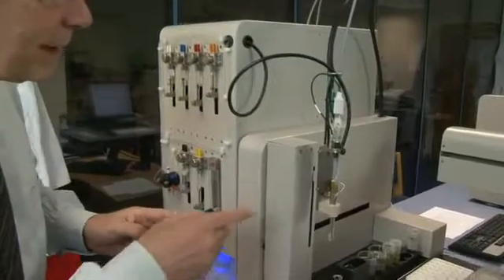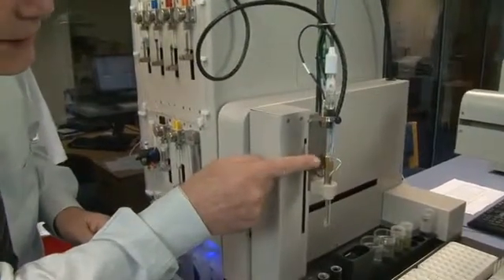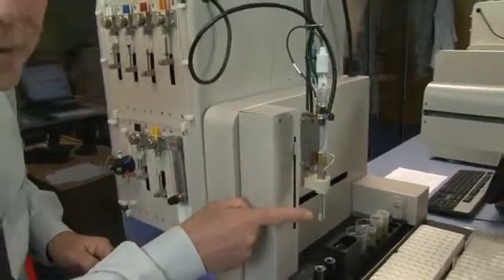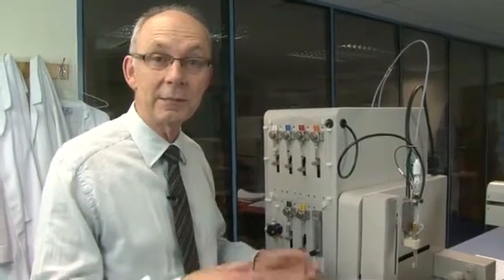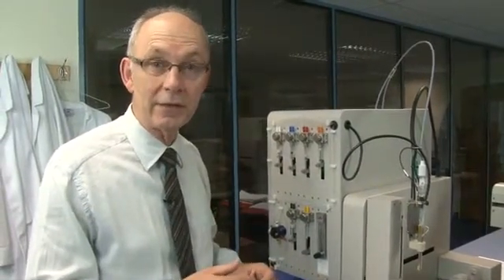Also in here we have a stirrer. You can see at the left hand side with the brass top and the little piece at the bottom. That's a stirrer. We can stir up to 10,000 RPM or down to very slow speeds, all computer controlled, stirring during the experiment to mix the sample and titrants and the octanol.